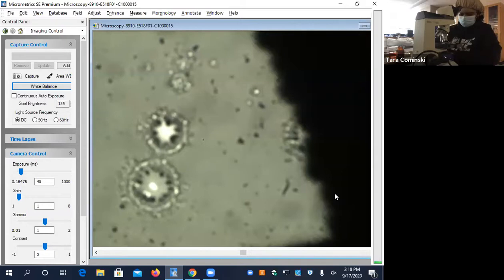There you go. All right, and then you just put your cover slip on top. That's enough. You kind of squeeze it down a little bit, but not too hard because you'll break the cover slip, so be careful. Yep, there you go. You can push down a little bit on it, and then you're going to just put it under there. So you'll see it's a little thick, so it's okay. You'll do the best you can with getting it in focus.